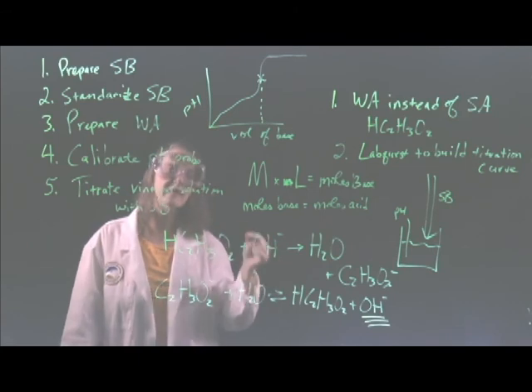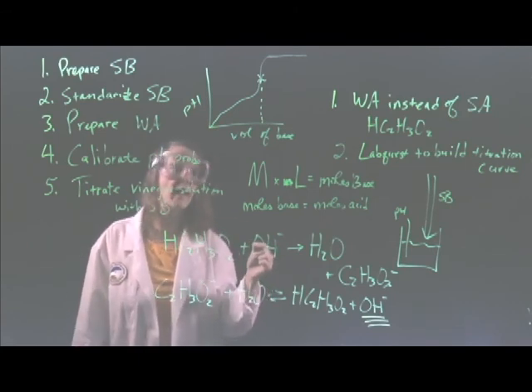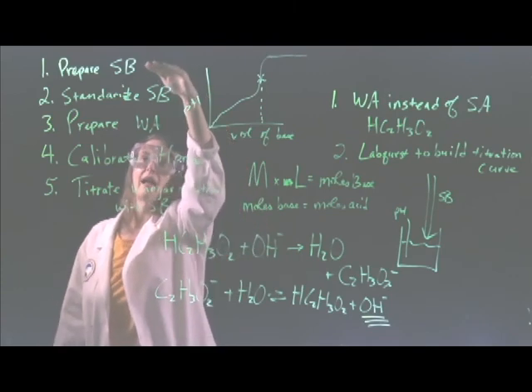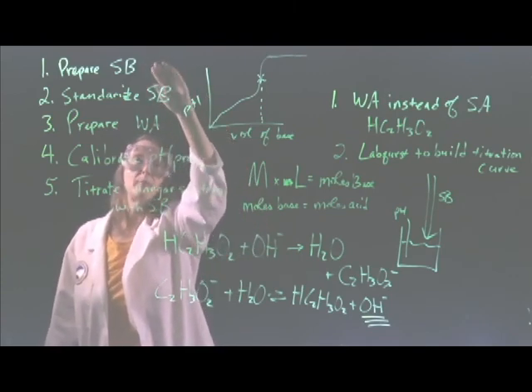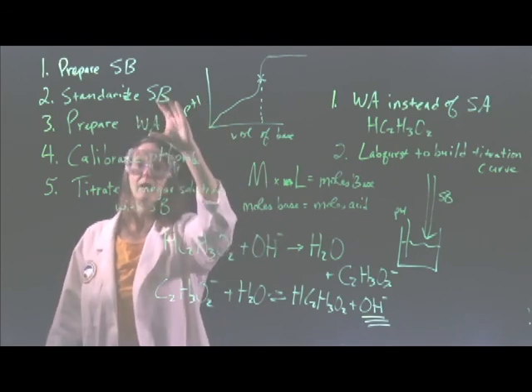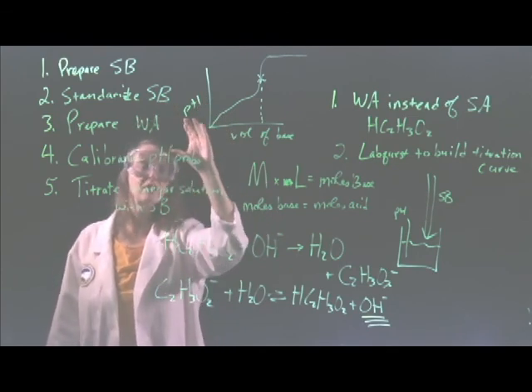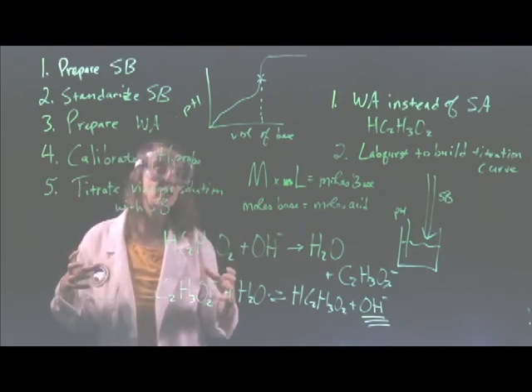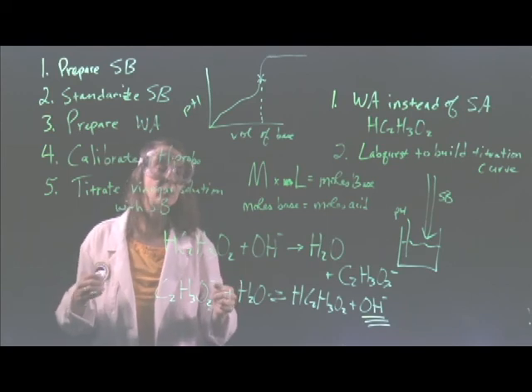One other note, time can be a factor in this lab. I recommend that you spend the first hour of the lab doing the strong base preparation and standardization. Think of the second hour of the lab being used to prepare the acid solution and the pH probe, then the last hour of the lab for the titration itself, and you should be able to get it worked in.